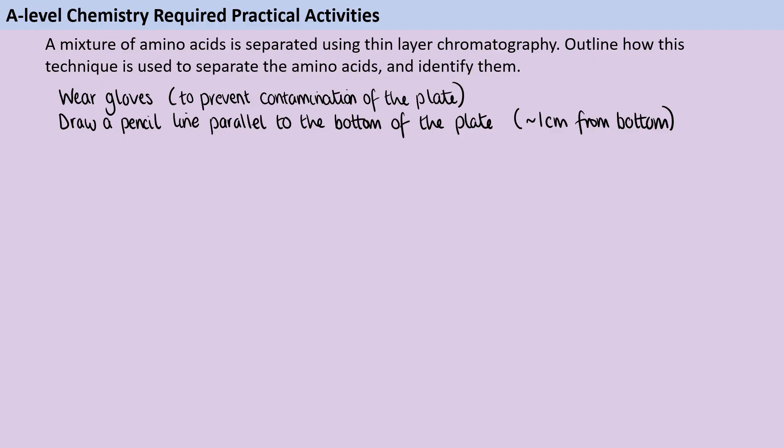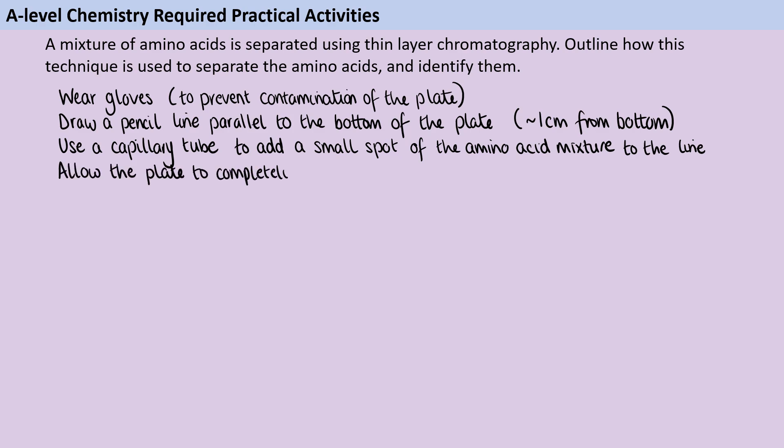Next we need to add our mixture that we're going to try and separate. We're going to do this using a capillary tube so that we can add a nice really small spot and we're going to add that spot of the amino acid mixture onto that pencil start line that we've drawn. Then it's important that we leave the plate to completely air dry before we actually do the chromatography.